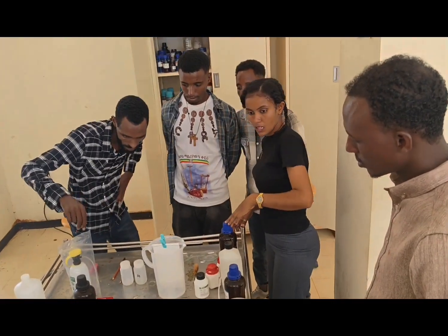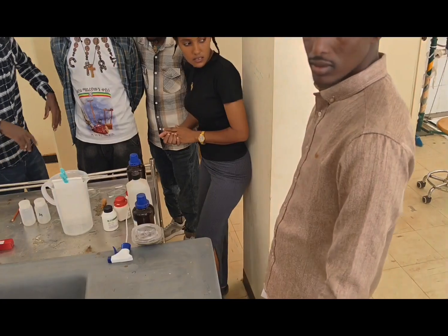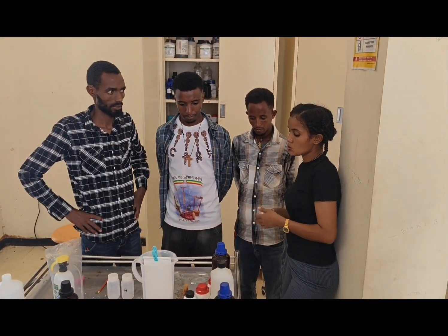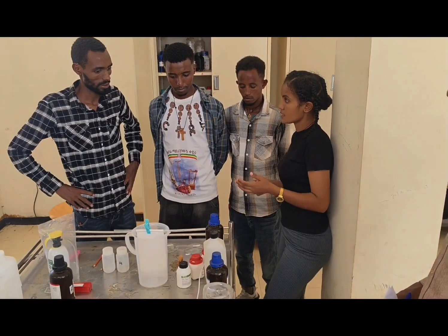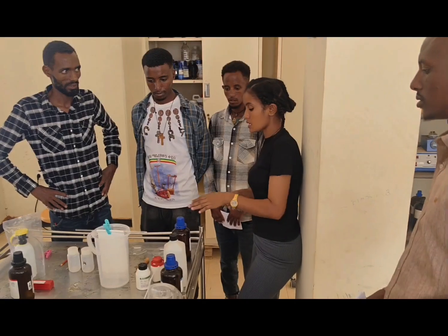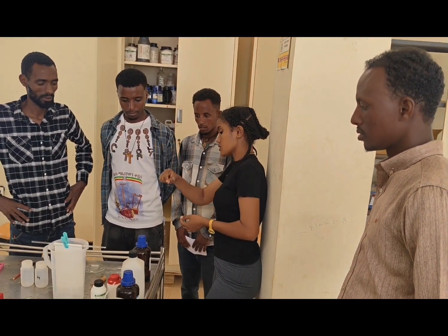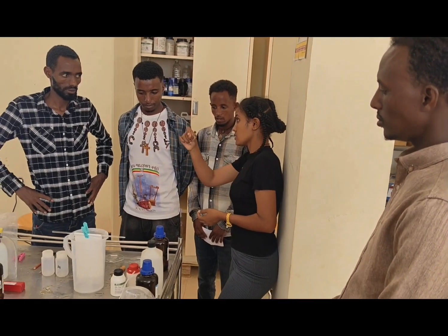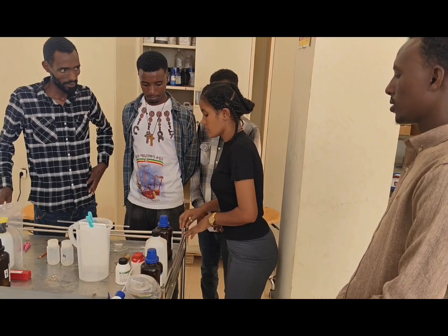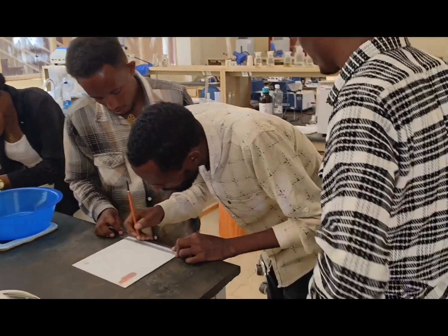You can see, and we will use the chemical called ninhydrin. That is very important. That is there at the back side of the rack. So we can use that ninhydrin for the identification of the amino acids. When we spray the dried paper and the dried thin layer after finishing the experiment, we can spray the ninhydrin on the paper and the TLC so that after drying, the amino acids react with the ninhydrin to produce purple colored spots.